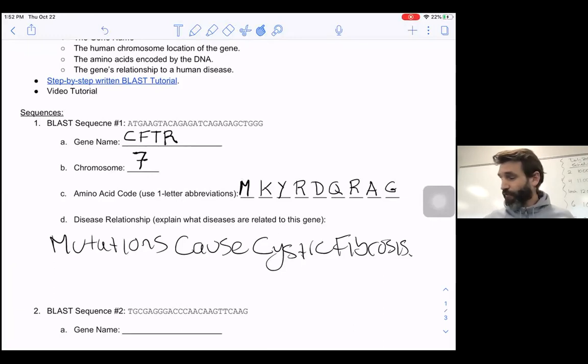And this is really cool. So from a sequence of 27 nucleotides here, a DNA sequence, we can search this database and show that this little piece of DNA is located in the cystic fibrosis gene. And there's a huge array of applications using this database. Some of it can be for archaeologists or paleoanthropologists that pull out DNA from Neanderthal bones or old human bones, just little bits of DNA, and they can search this database and see what genes match up with human genes of modern humans. And they can then say how many mutations, how close Neanderthals were related to humans.